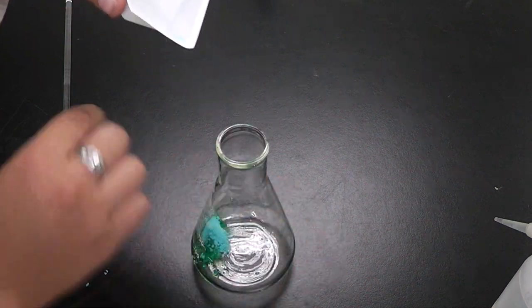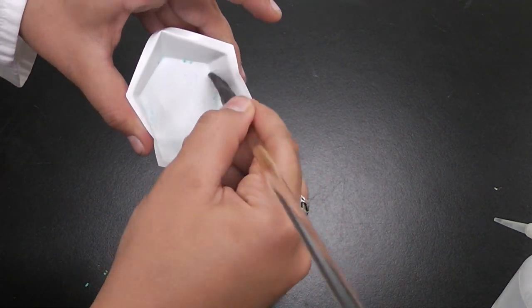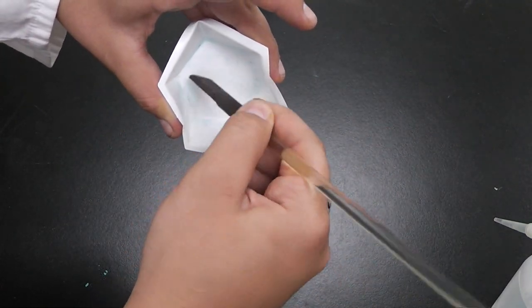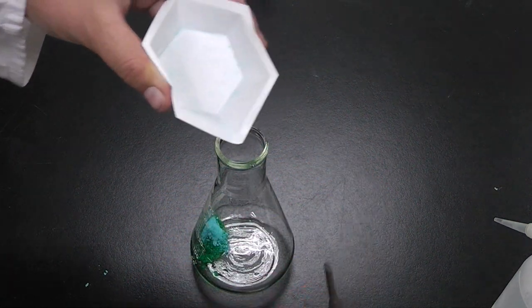Once that's finished, you simply take your rubber policeman and scrape as much as you can into the Erlenmeyer flask. Make sure that you scrape all the corners and the edges, getting all the sample into the Erlenmeyer flask.